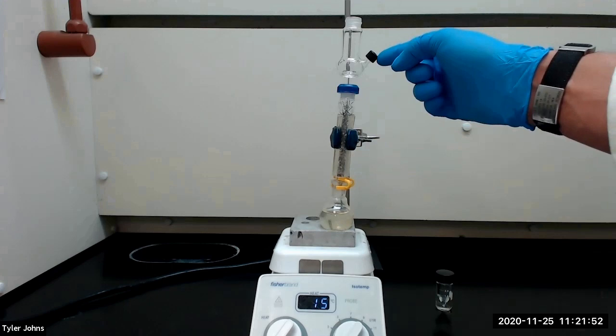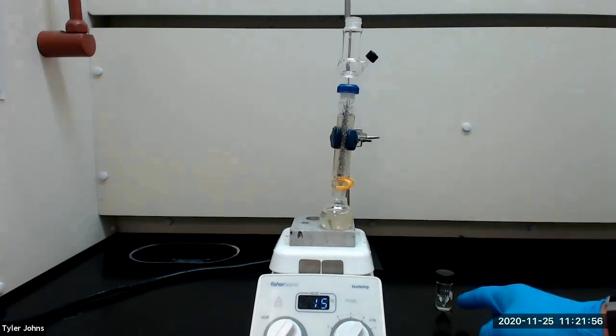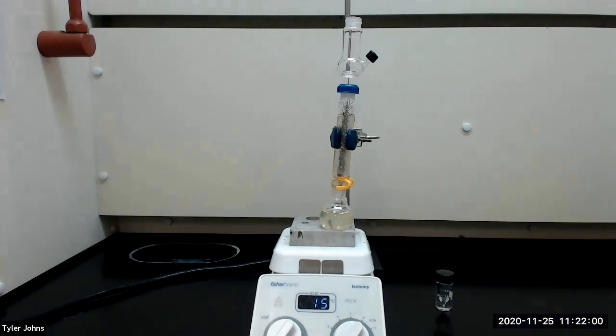We will collect the distillate from the side port of the Hickman head using a pasture pipette and transfer it to a pre-weighed 3 milliliter conical vial. It is important to distill the liquid slowly through the fractionating column to achieve the best possible separation. To do this, we will maintain the heat setting required to boil the liquid at the lowest possible setting. We will stop the distillation after collecting 0.4 milliliters of distillate.